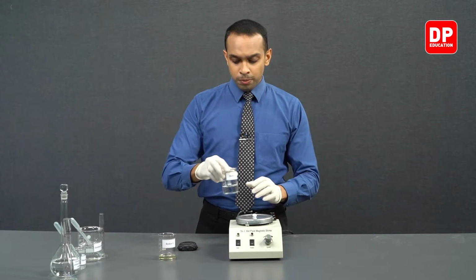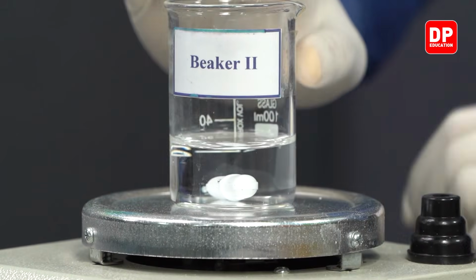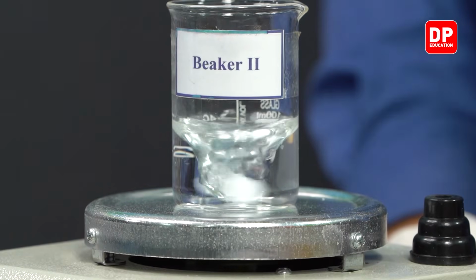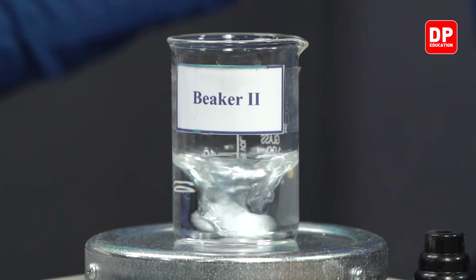So as we did before, we will be placing this stirring rod over here, and we can start mixing the reactants together, and we'll be adding 5 drops of starch solution as well.